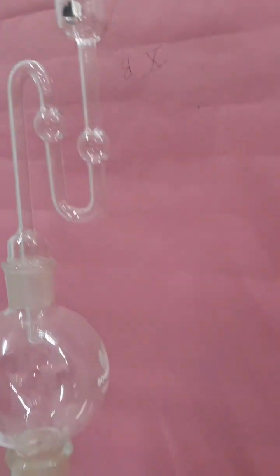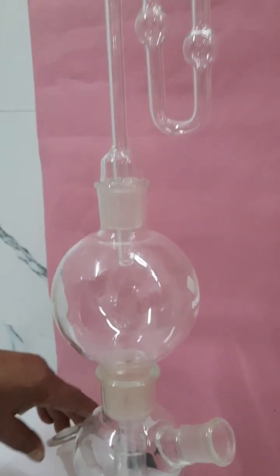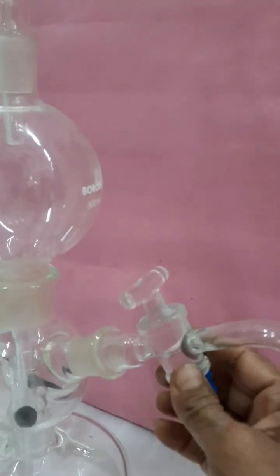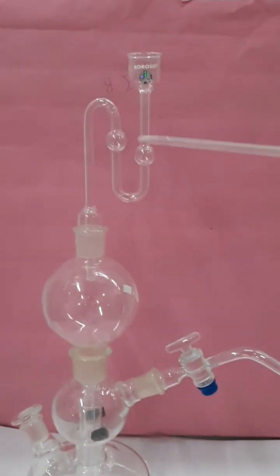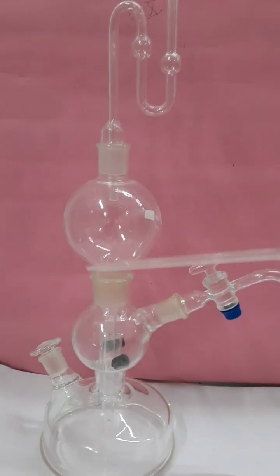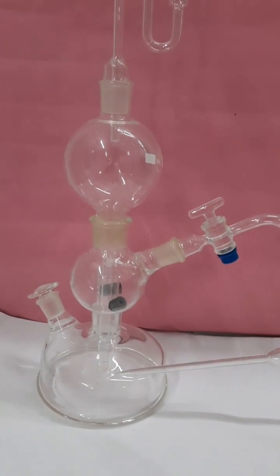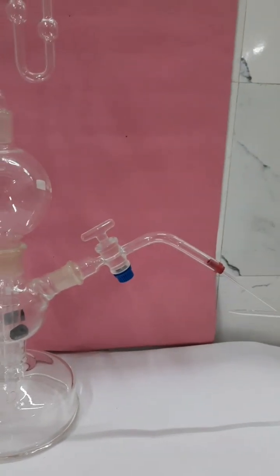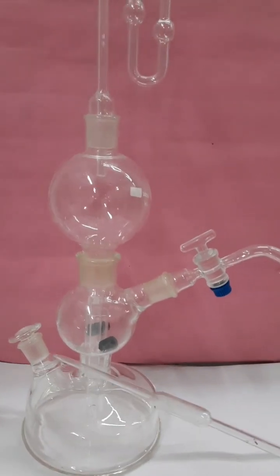The topmost part is the thistle funnel. The first chamber extends as a long tube that passes through the middle chamber and enters into the third chamber. Ferrous sulfide stick is added into the middle chamber with a stopcock attached to it. This is the lower chamber, and this is the delivery tube containing the stopcock.